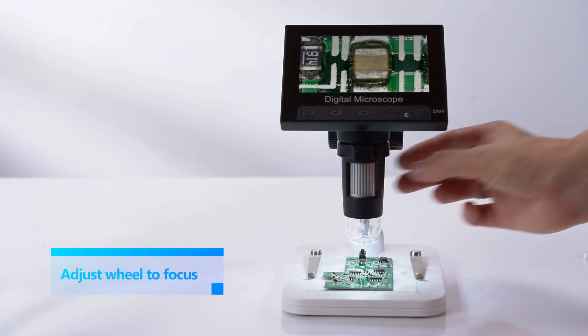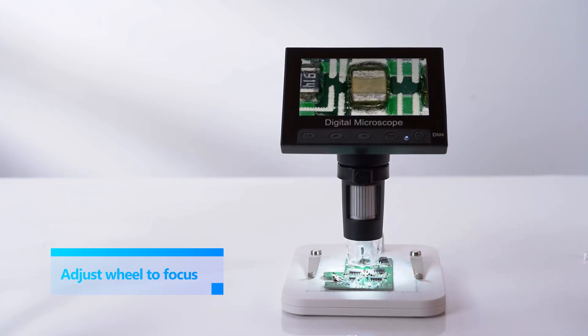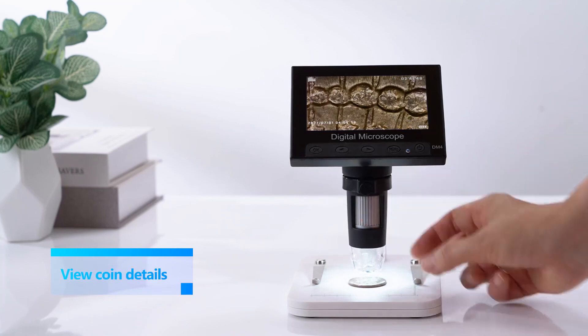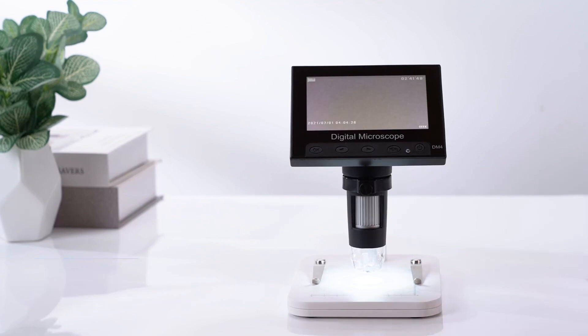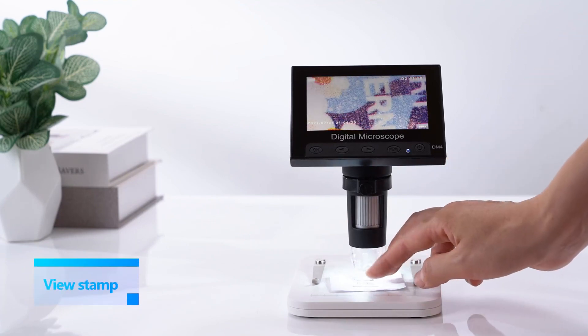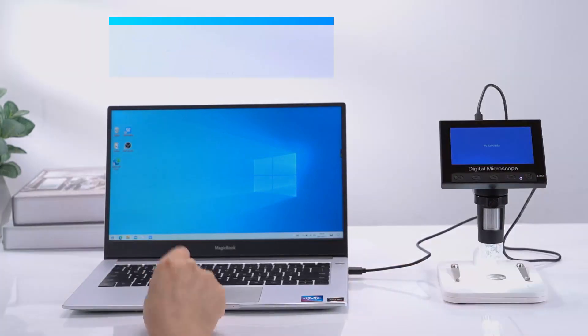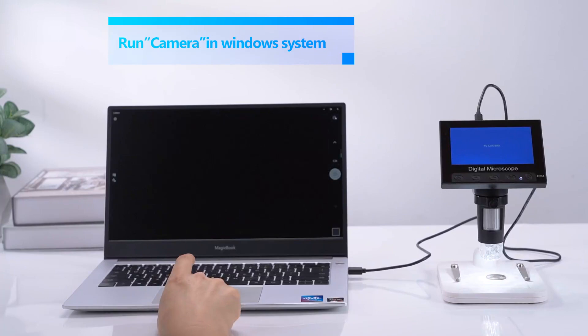Say goodbye to eye strain. This coin magnifier boasts a powerful 1000x zoom, letting you see incredible details on coins, biology samples, and even trichomes. While actual magnification varies with distance, the potential is impressive. You can also connect it to your PC — compatible with Windows and MacBook — for a larger display, perfect for sharing or detailed analysis.